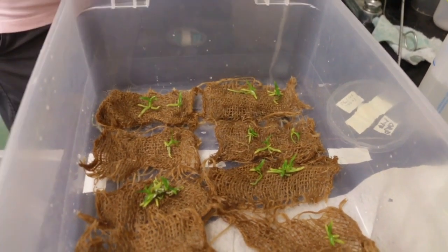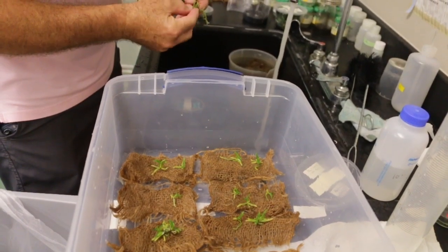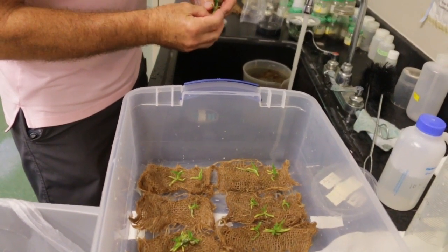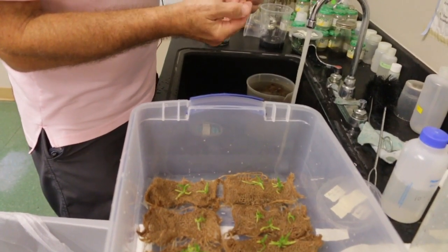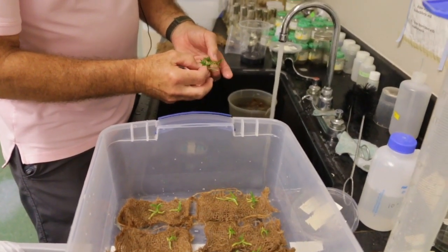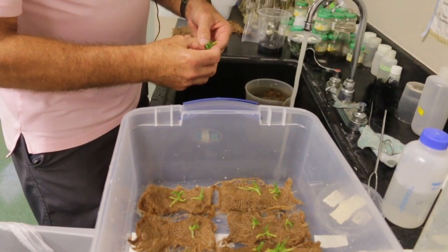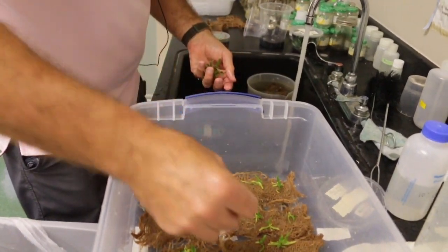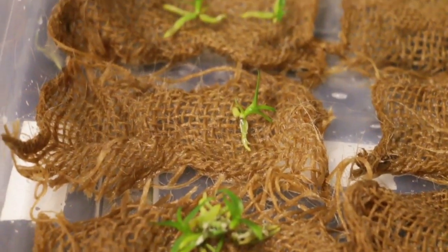I'm showing you how I do this, and I'm making a video, but I also want to make it clear, and I think it should be clear, I've never done this before. This is my first deflasking of this Guarianthe species on burlap. So I don't know whether this is going to work. But I'm just trying it. And that's why we do this stuff. That's why you do science, in order to see if it works or not. If it doesn't work, I'll share that with you.